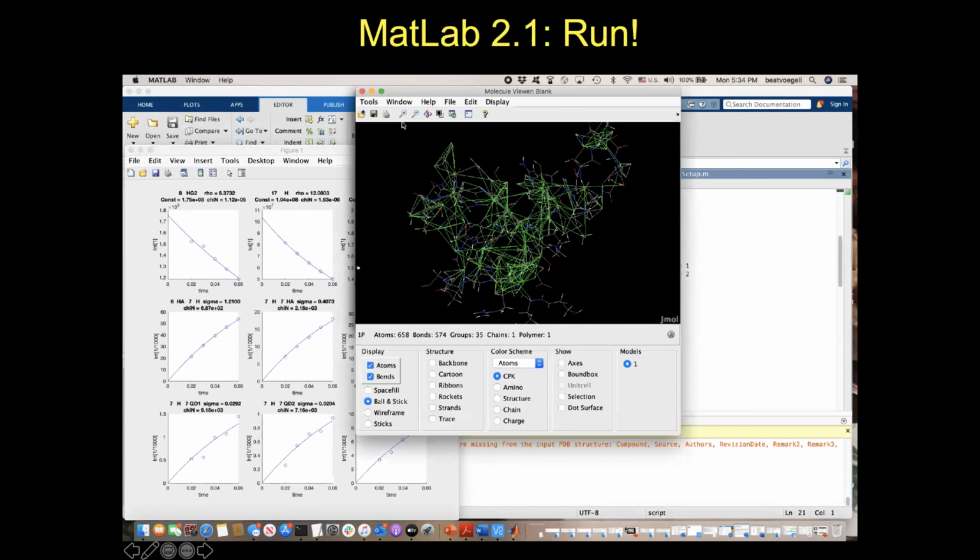Okay, I hope you were able to get more of a glimpse of it. So here you see all the NOEs that we could evaluate directly plotted on the PDB structure that you input. So you get an idea of how dense your NOE network is. We also output a file that contains a Chimera script where you can just read it into Chimera and it will directly plot these distances. This is very nice to make figures for publications.